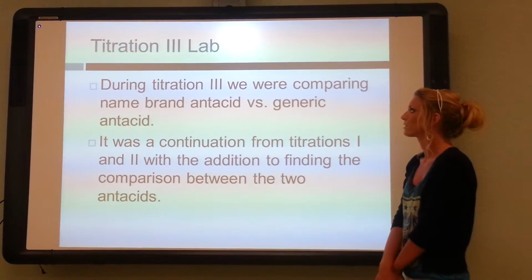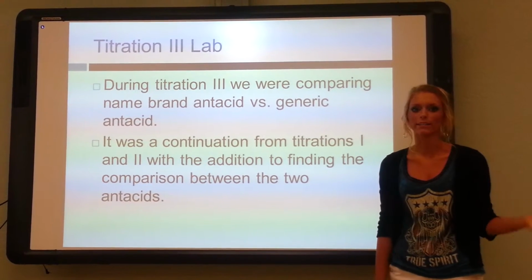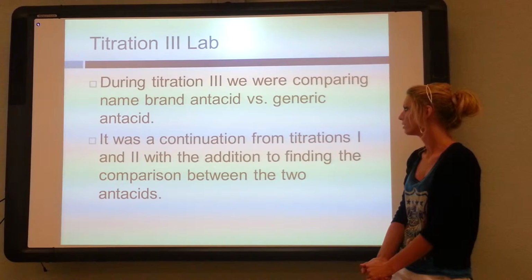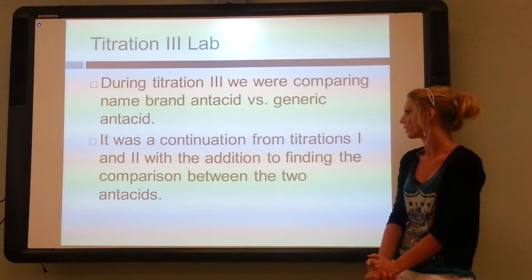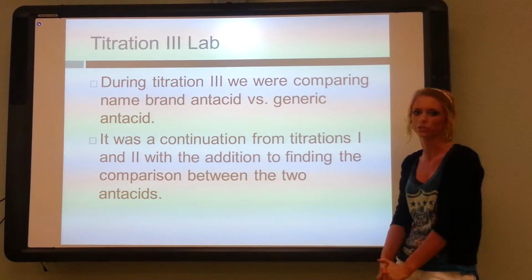Our final lab was the Titration 3 lab, and in this lab, we were comparing name brand antacids to generic antacids. It was a continuation from Titrations 1 and 2, with the addition of finding the comparison between the two antacids.